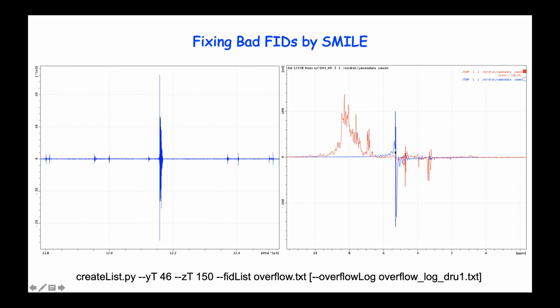the water suppression was completely messed up, and gave this kind of corrupted FID. And by the way, we did a lot of stuff to fix it, but we never knew what we did to fix it. In the end, it just went away. Okay. It may also possibly be related to some of the reconstruction work that's going on near the magnet, outside the magnet room. So anyway, I'll show you in the demo an example of how to fix this kind of bad data points.